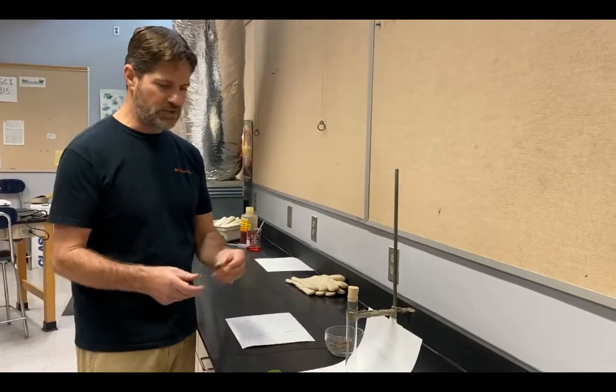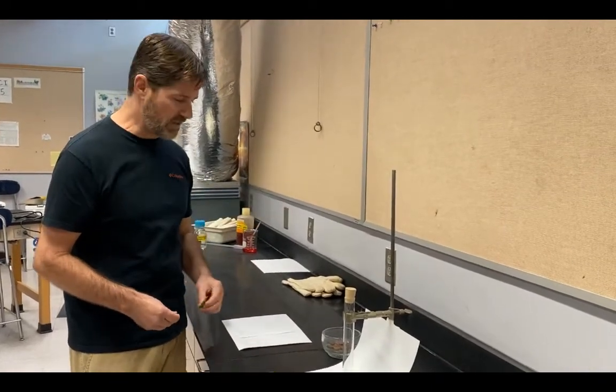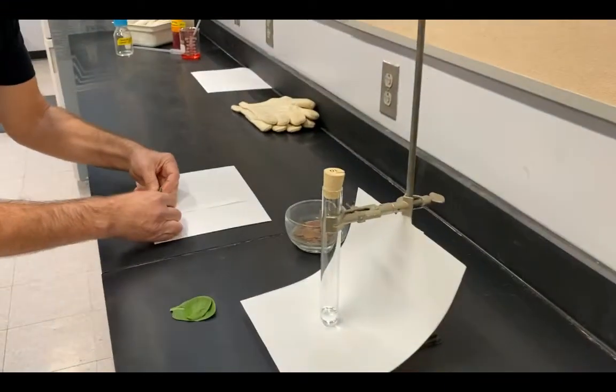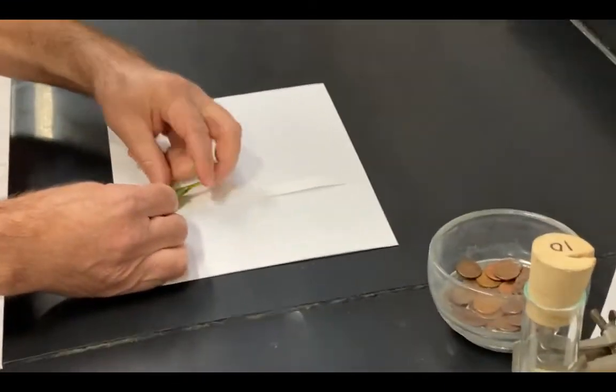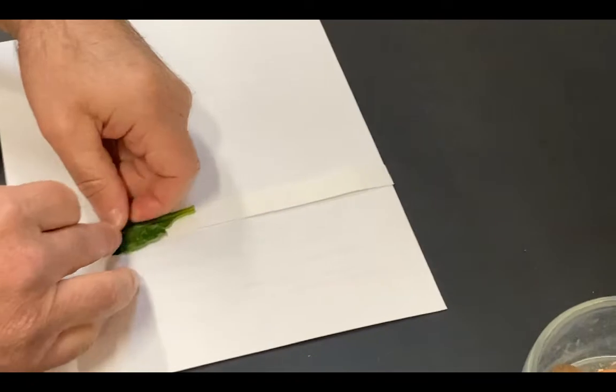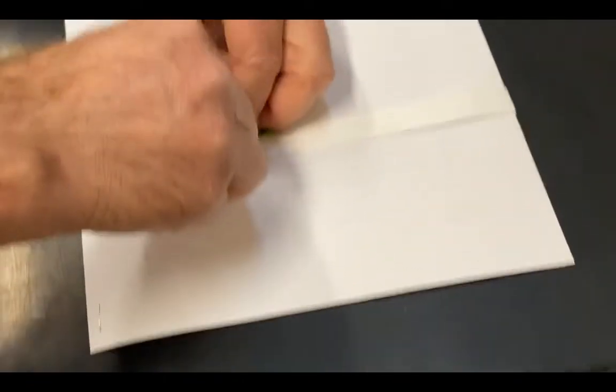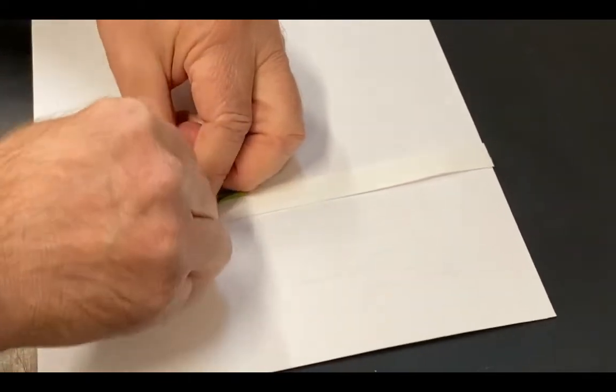So the first thing I have to do is I actually need to get some pigment on that paper. So to do that, I'm going to leave a gap down at the bottom of my paper and I'm going to place a leaf across this and I'm going to start rolling this penny to basically squish some of that pigment into there.